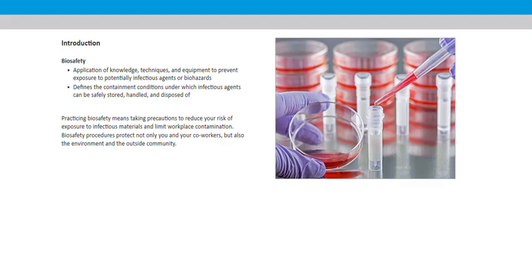Biosafety is the application of knowledge, techniques, and equipment to prevent exposure to potentially infectious agents or biohazards.